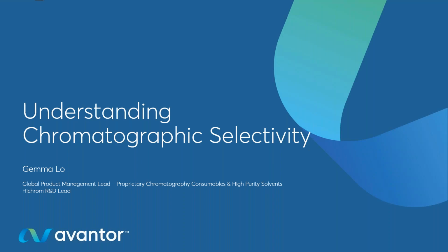Understanding Chromatographic Selectivity, which is part one of a three-part series titled A Systematic UHPLC and HPLC Method Development Strategy with Complementary Stationary Phases to Maximize Selectivity and Resolution.